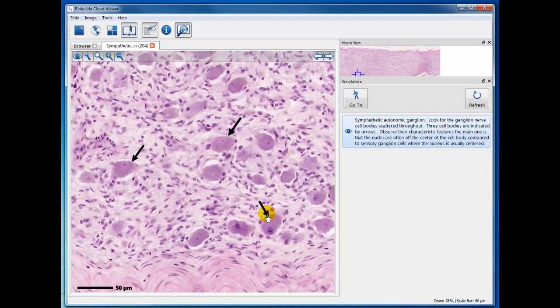And one of the features of a sympathetic neuron, of course, here's the cytoplasm, and it's fairly basophilic because it's loaded with rough endoplasmic reticulum, because all neurons are producing protein all the time. The transmitter substances as well as the enzymes that destroy the transmitter substance at the ends of the nerve fibers, at the terminations and synapses.